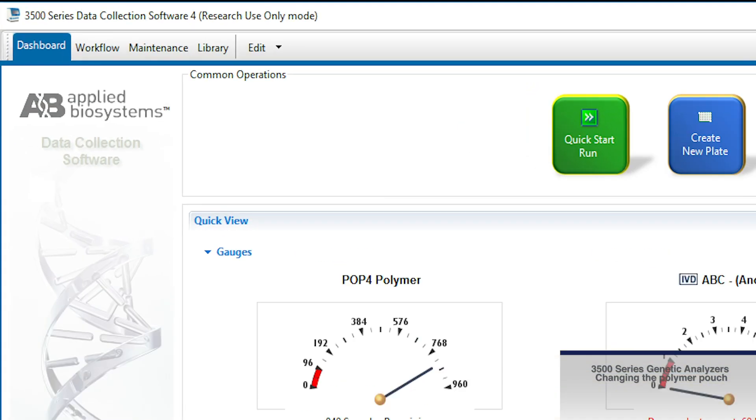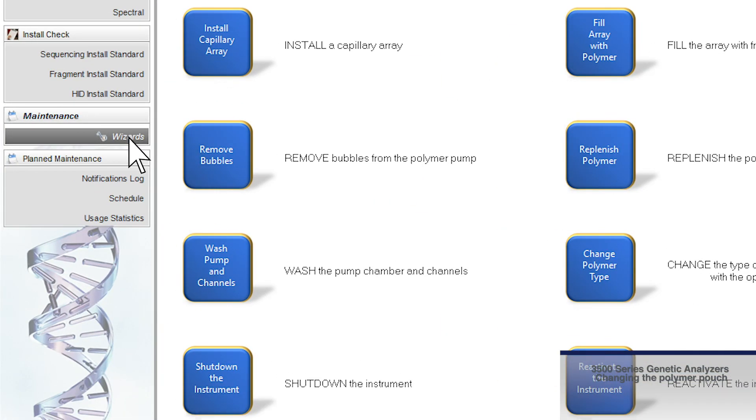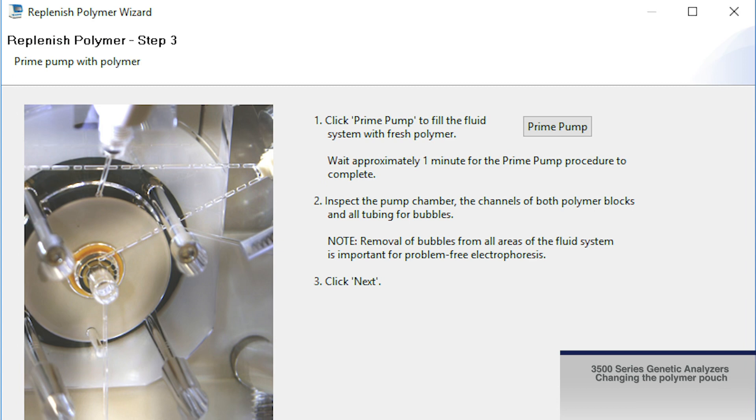To change the polymer pouch, go to the maintenance tab, then choose Wizards, then select the Replenish the Polymer wizard. This wizard will take you step by step through changing the polymer.